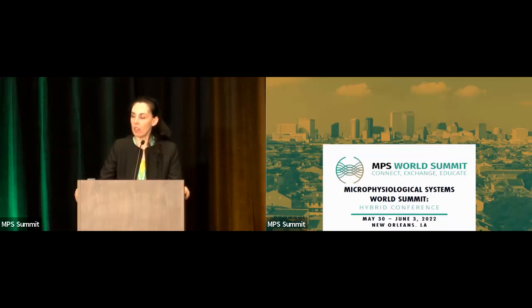Yes, it's very nice already. Within a couple of days, the cells do spread independently of where they are in the curvature.